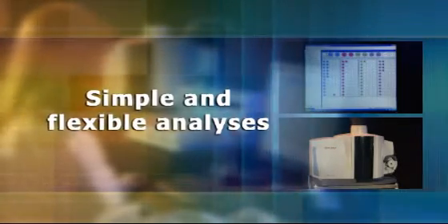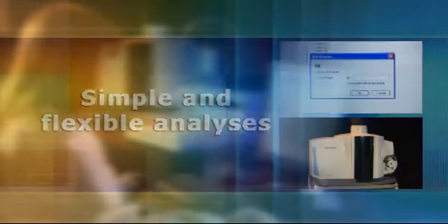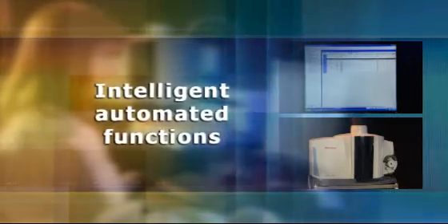Features include a graphical sample location display, real-time sample list editing and intelligent automated functions.